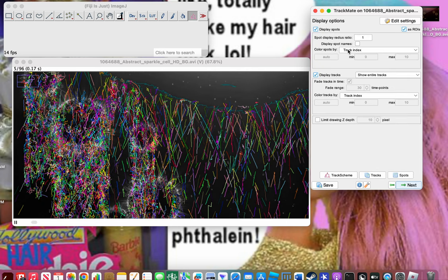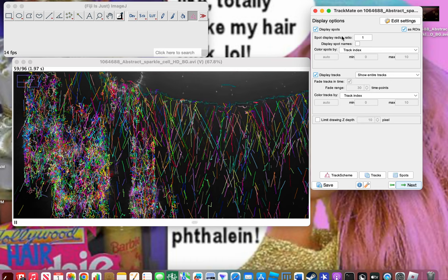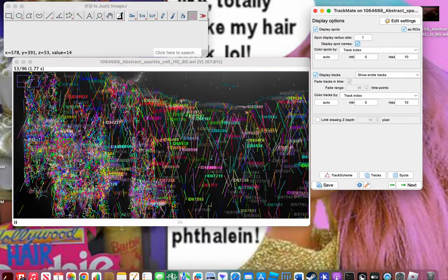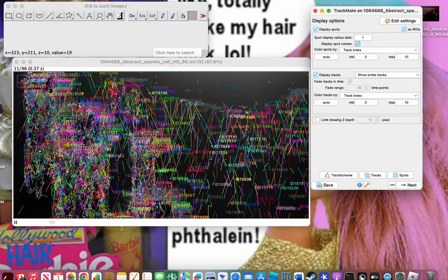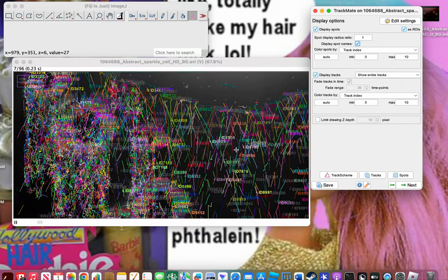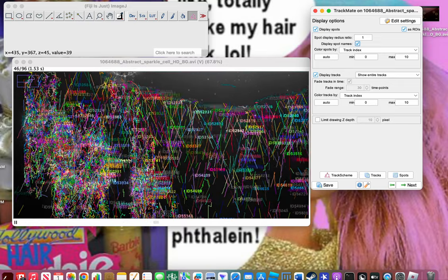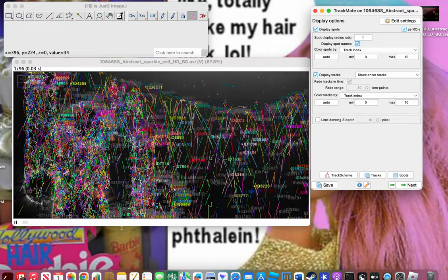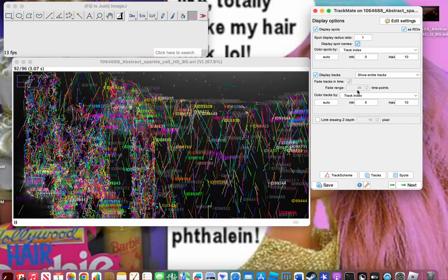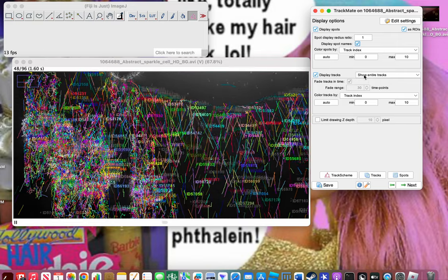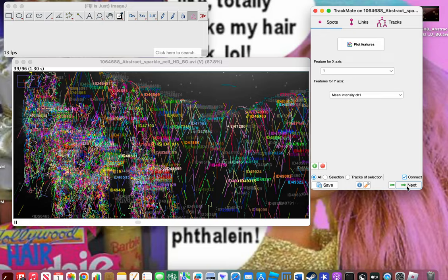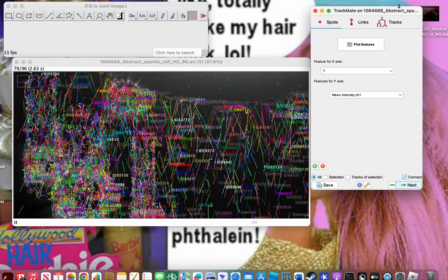There are options like display track radius and display track name. Each track has a different ID — I have thousands of tracks because this is a very complex image. If you have 15 different things you're tracking, there will only be 15 IDs, so don't worry about the crazy numbers you're seeing. You can change display options here, but I'm going to keep it the same. Click Next — here is my favorite part, which will likely be the most useful to you.